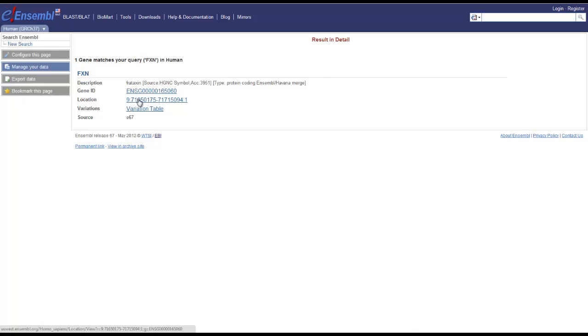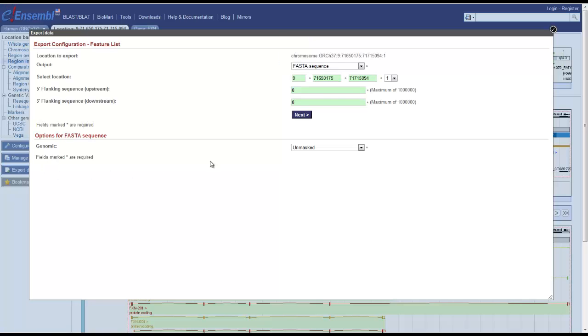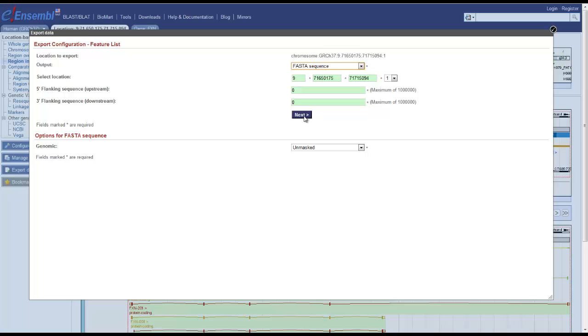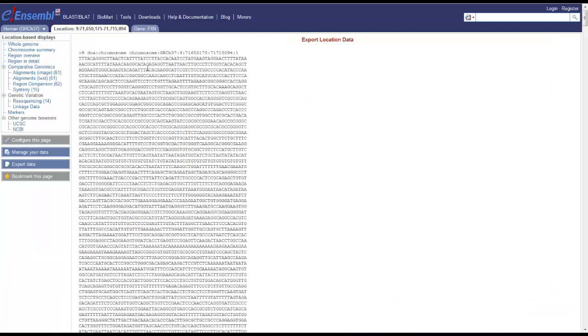And now look at the location of the gene. Note this location, because we'll use it to compare locations for pancreatic cancer research. We're going to export this data just so we can get a feel for it. We can input this data into other tools. Export as HTML and FASTA, and you can notice the code here.